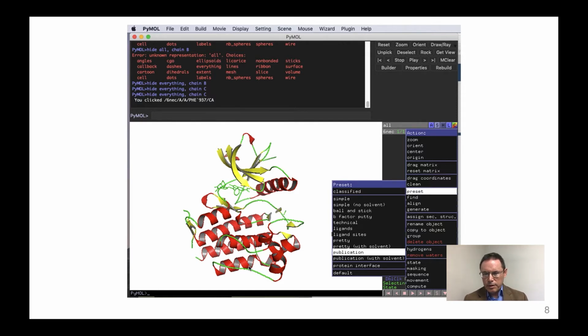The default display normally would be just a display of the structure as sticks, with the sticks representing bonds between the atoms. So the raw data are just the atomic coordinates of the atoms. And these parameter settings allow the generation of these fancy renderings. So in this case, we have a fancy alpha helix in which the interior of the alpha helix has been colored gray. There are additional cascading pull-down menus across the top, and we'll return to one of these later.